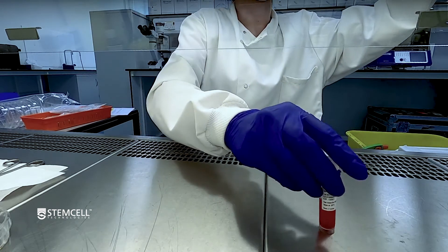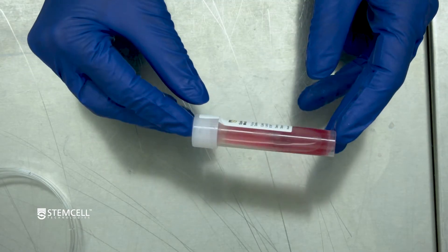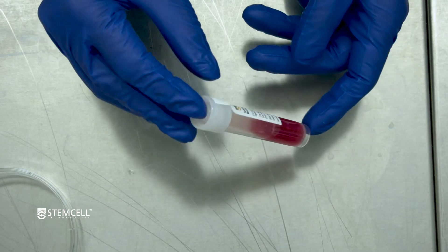For best results, gently agitate the tube every 5 minutes during the incubation, or place the tube horizontally on a rocking platform with continuous agitation.